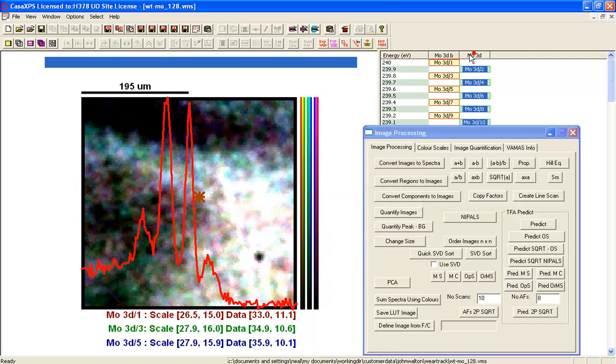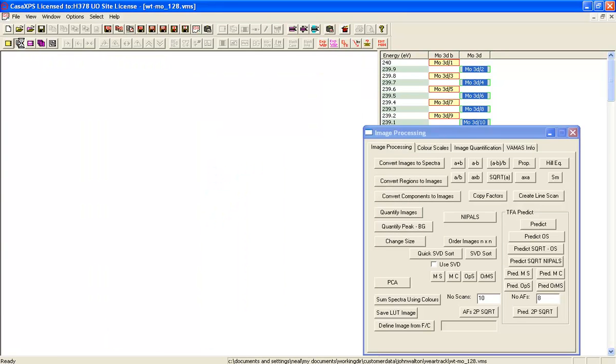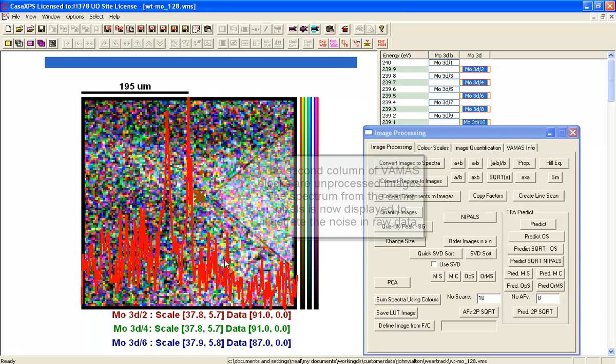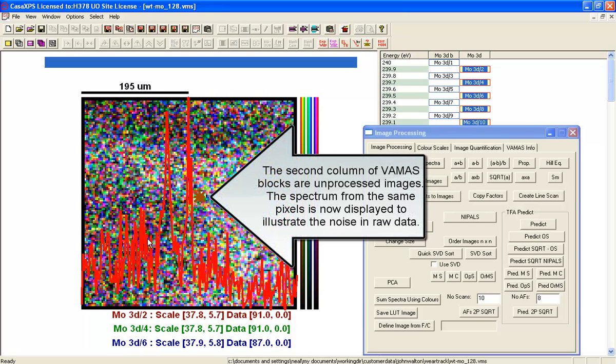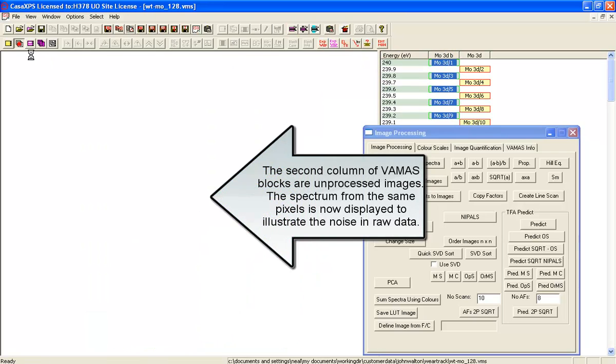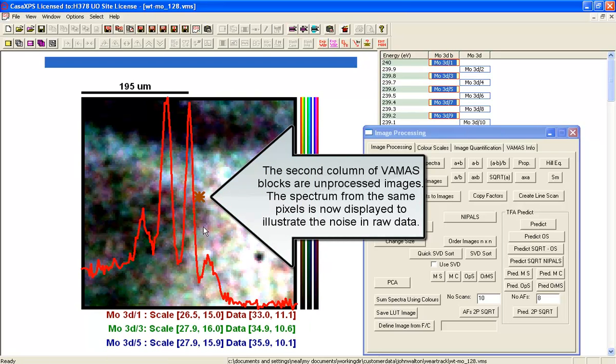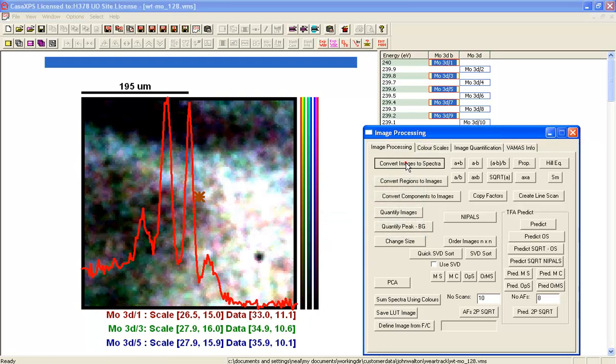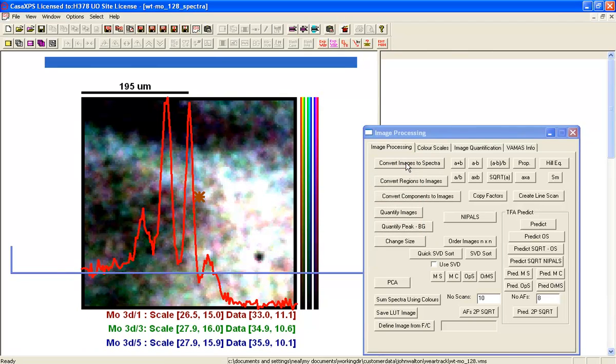If I now overlay the unprocessed data that are offset by 0.1 of an eV, you can now see the comparison between an unprocessed form and the processed form. So let's use the processed form and create some spectra.